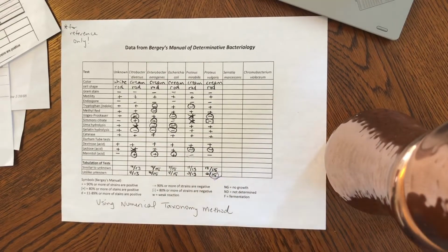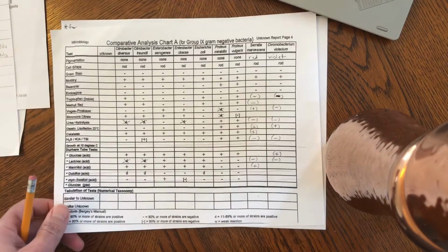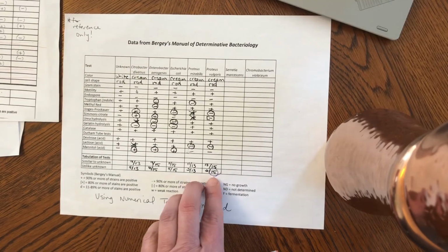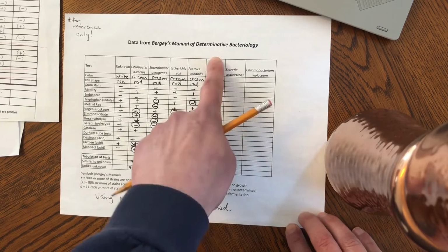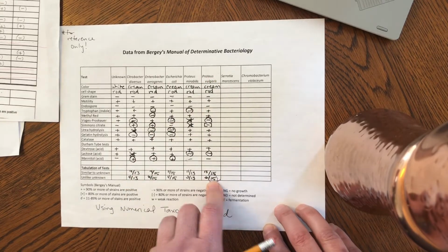So you may end up with some that are very, very similar. I don't think that any of you will end up with 2 bacteria that are exactly the same number. I think you won't. But if you end up with 1 or 2 that are very similar, you want to go with the one that's got the best ratio, obviously. So if you have a ratio of 13 out of 15, that is probably likely to be your bacteria. So that would say Proteus vulgaris is likely to be my unknown.